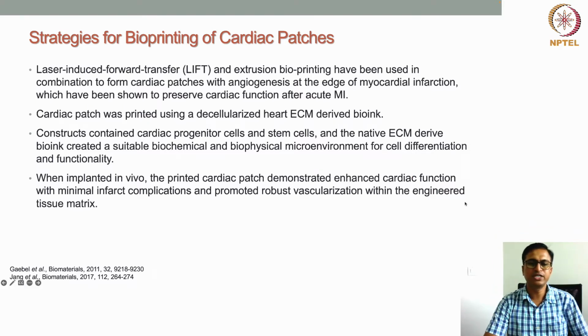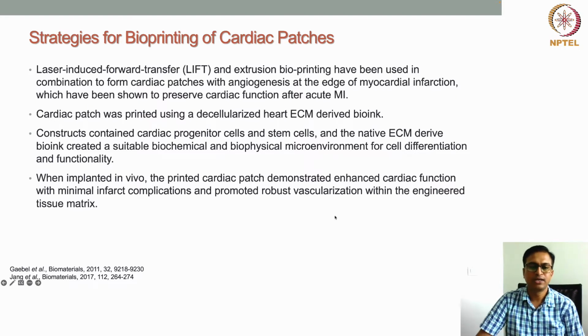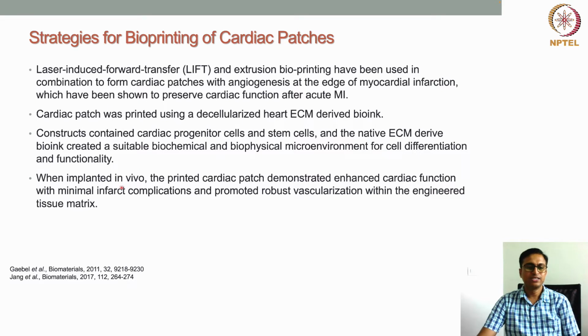So the major advantage of using tissue specific bioink, in this case suppose heart tissue bioink, is that they provide a suitable biochemical and biophysical microenvironment for cell differentiation. In this particular work they have used cardiac progenitor cells and stem cells, and loaded them, encapsulated them, into the ECM derived bioink, because this ECM derived bioink provides a natural, biomimicking microenvironment.